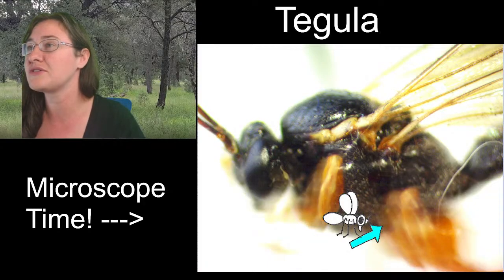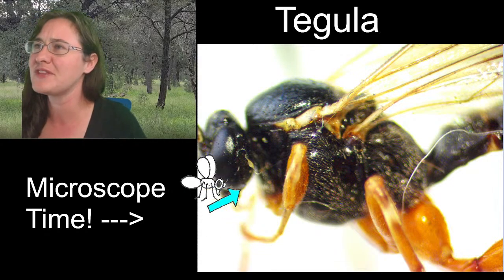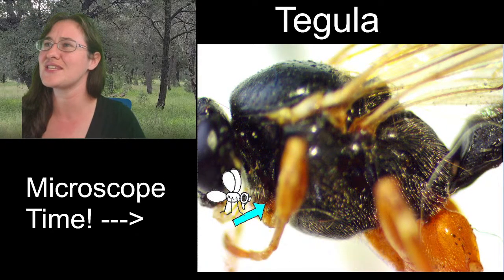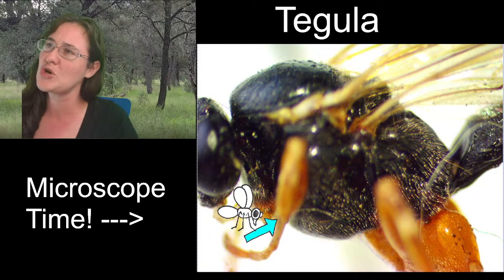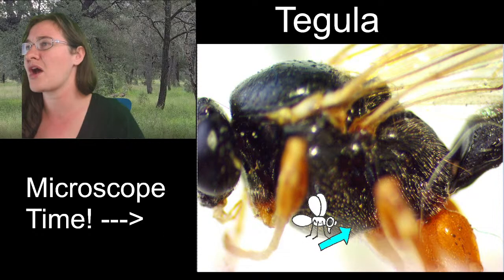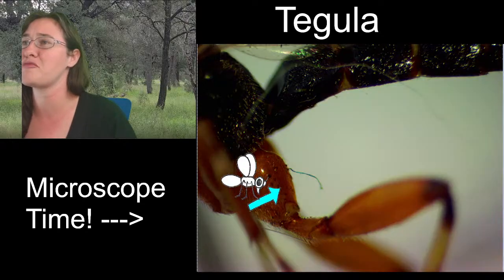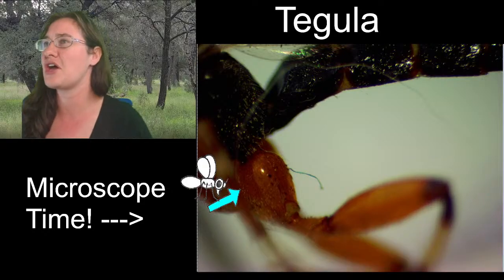If we look right about here, I believe that the coxa of the first leg is black. Nope. It's orange too. Right here. So this is the coxa of the first leg. It's orange. And then there is a trochanter in there. And then the femur, the tibia, and the tarsi. And then when we're looking back here where our middle and our hind legs go, this part right here, that's actually our coxa, or that's our hip bone. And then we've got the trochanter here, and then the femur, tibia, tarsi, all those segments.